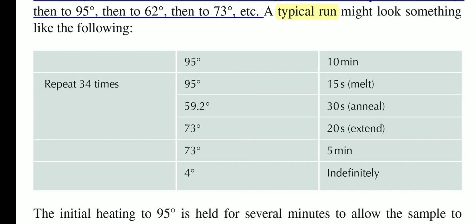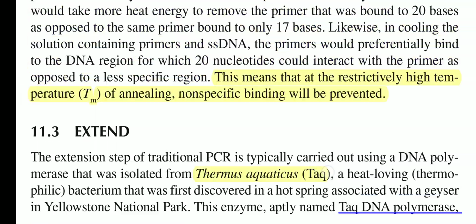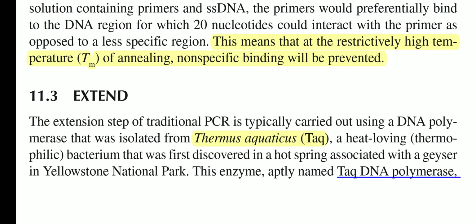So in this picture you can clearly see that different steps require different times for different functions. Now let's come back once again to the extension process. We have done annealing, and we have done denaturation, meaning separation from double-stranded to single-stranded DNA.